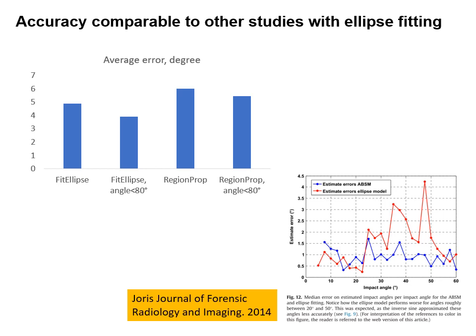And you can see that the error that is reported by my code is close to other estimates of the error that have been done, for example, by Joris using the ellipse fitting model, where he also had errors that were up to 4 degrees. So that's something to know. And I always say it's not important to have something perfect, because in this world we have nothing perfect. But what matters is to know the uncertainty of your measurement.